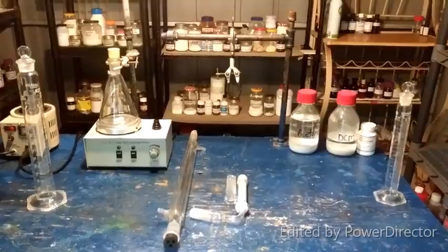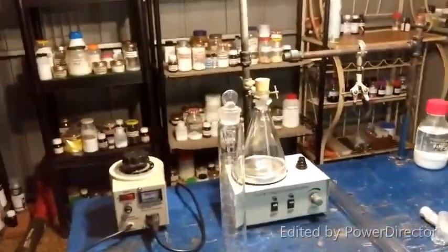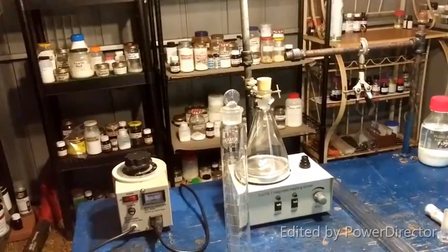And to ensure that the reflux is gentle, what I've done here is I have hooked my little hot plate stir plate thingamabobber up to the voltage regulator that I usually use for my heating mantle. I've already experimented with it, and at least with the flask empty, the stir bar will still turn, so that's a nice bonus.